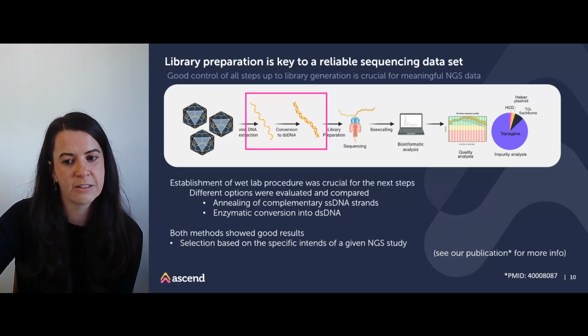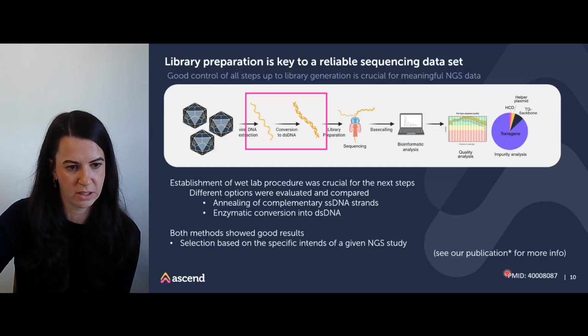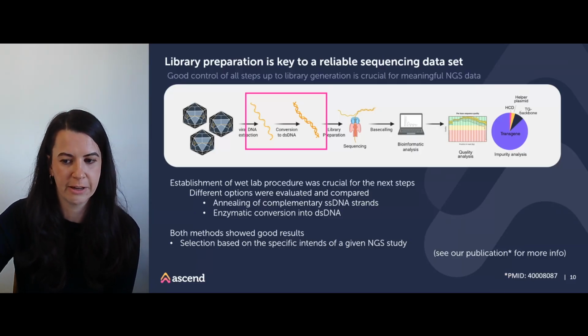And to this end, we invested effort in enzyme-mediated second-strand conversion. And this work was described in detail in our publication. But concluding, we can use both, and we do use both methods based on the question that we want to address with the experiment or the intent of a given NGS study by a customer.